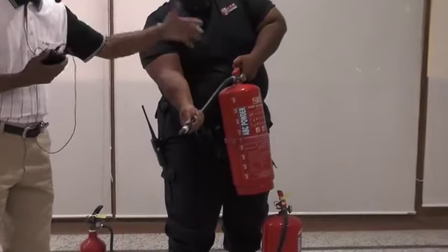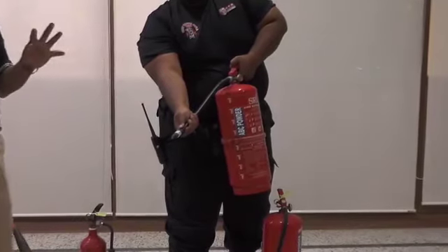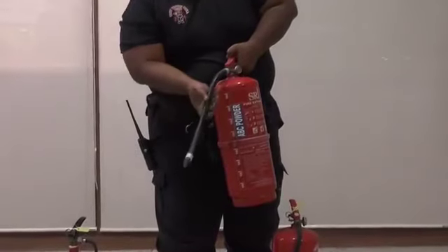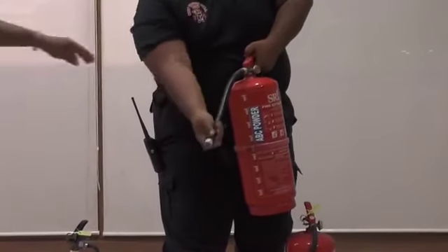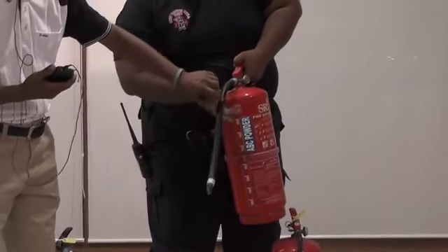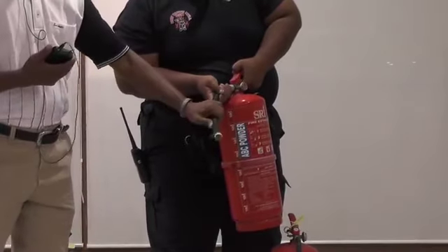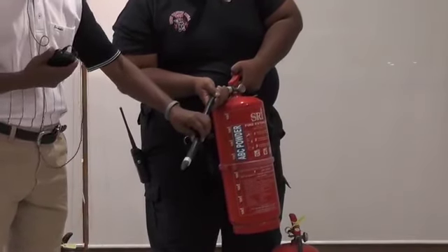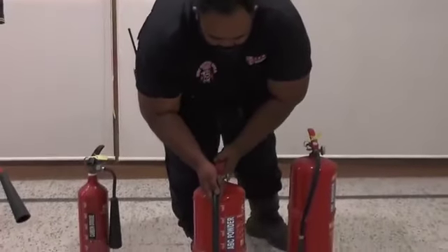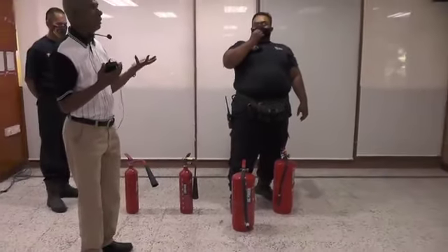The moment you start depressing the lever, the pressure is going to go up. 150 to 170 psi is very, very high. Do not put your hand behind it, because it's going to move. At 150 to 170 psi, it can break your humerus. Or if it touches some other area, well, God bless you.